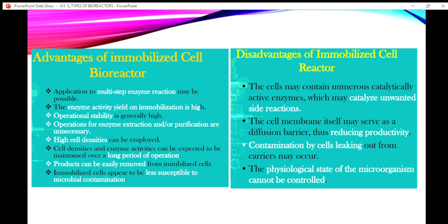Okay, and it can be used for a long period of time lah. Okay, and the product can be easily removed because your cell is entrapped in something. Once it forms a product, it will be freely inside your media. So using a suitable downstream processor, you can easily remove the product. Okay, but the disadvantage might be cell leaking, because you encapsulated your cell. So if the porous material pecah, your cell will leak out from your immobilized material.